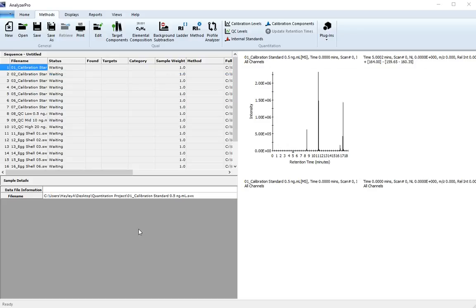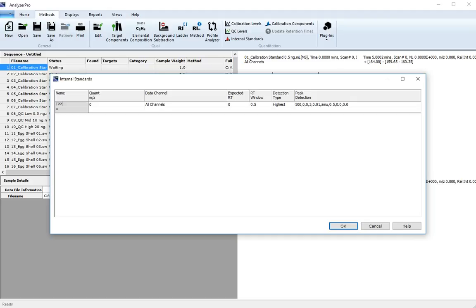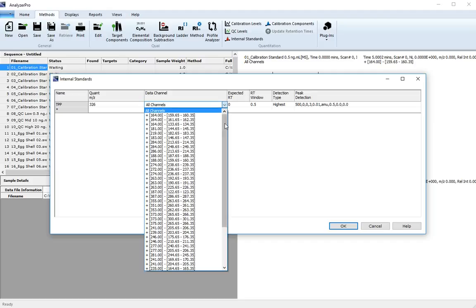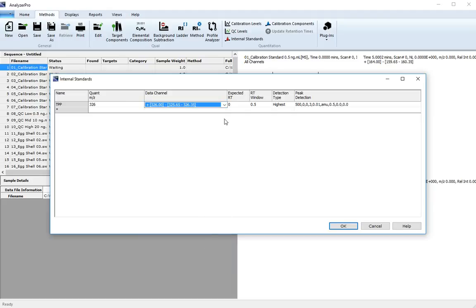You can now enter the parameters for your internal standard. Using the tutorial data, we're going to be using the compound TPP. The master charge we'll quantify on is 326, which we can select from the appropriate data channel. The expected retention time is 16 minutes 56.